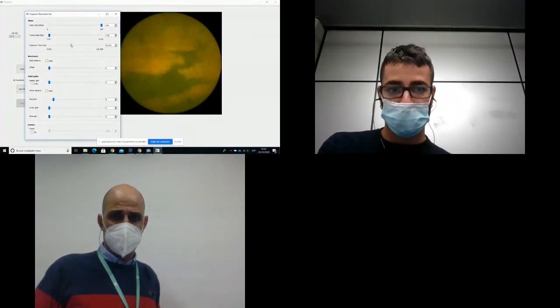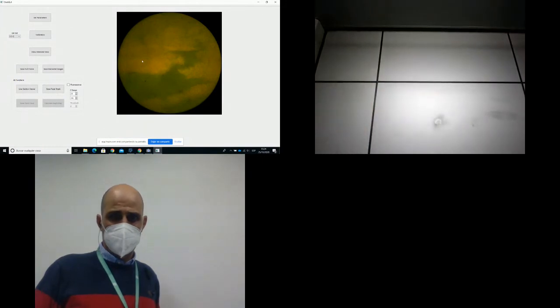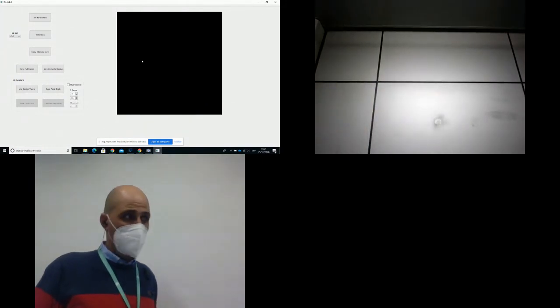Or you can directly look at your sample here in the software. I have to switch to a 40x for this sample.